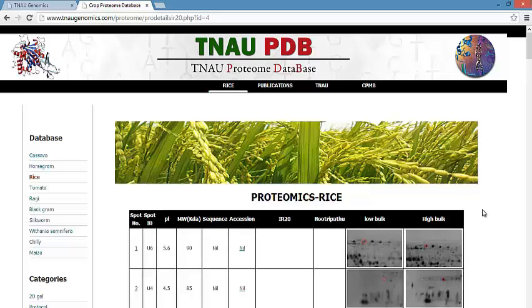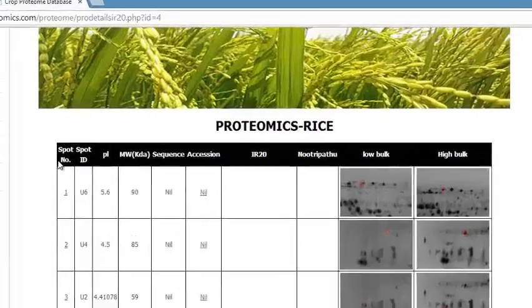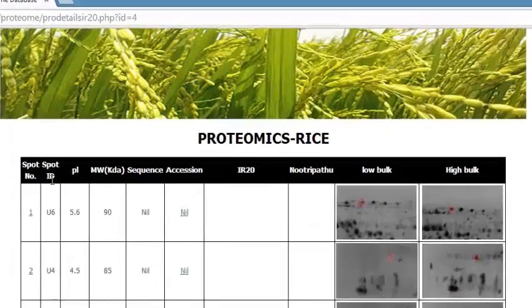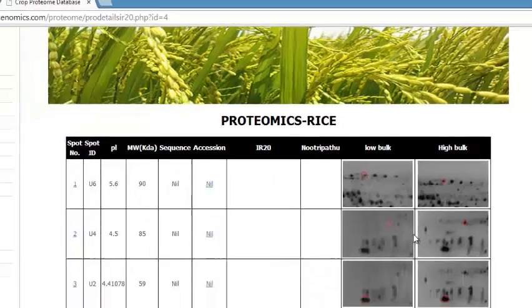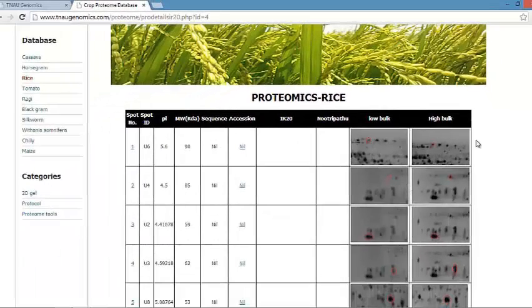The accession number links to the spots. The gel image is compared between IR20, Nutri-Pattu, and their low and high bulk. Each spot gives its spot ID, PI value, molecular weight, sequence, and accession number. The accession number links to NCBI.